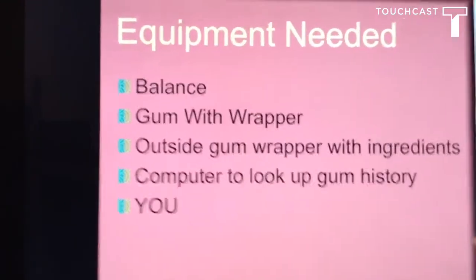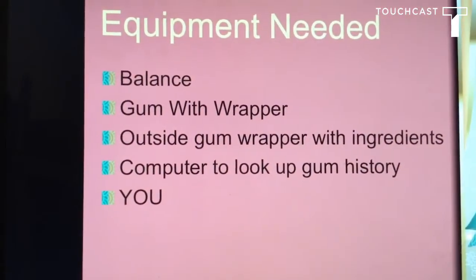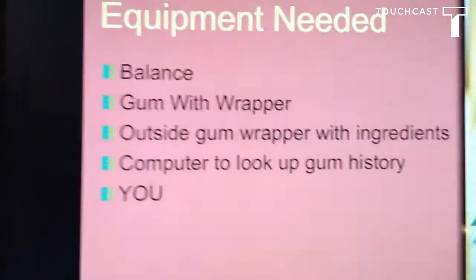You're going to need a balance, your gum with a wrapper, the outside gum wrapper with its ingredients, a computer to look up gum history, and you.